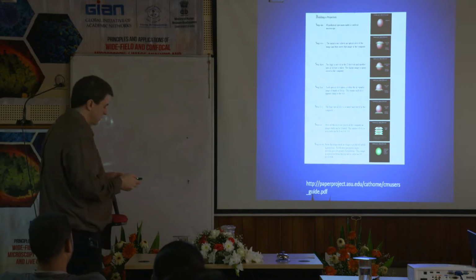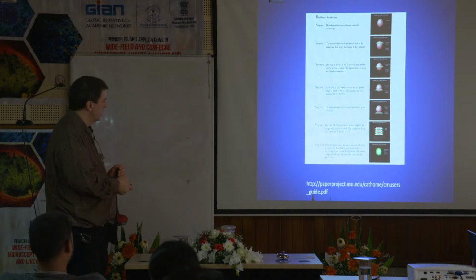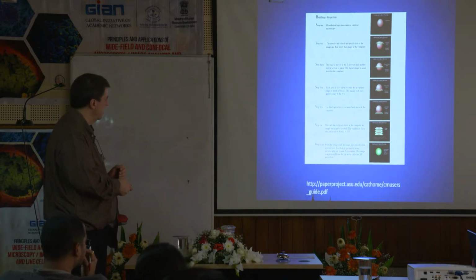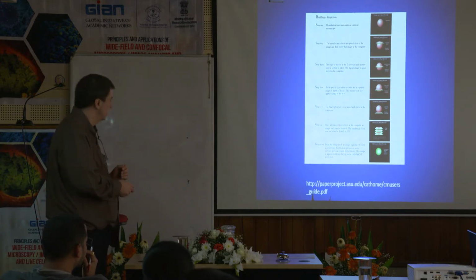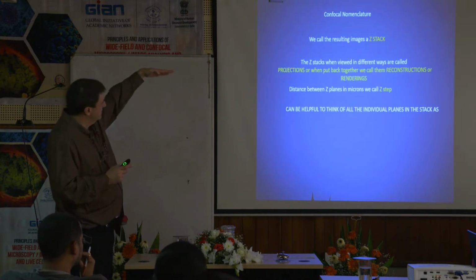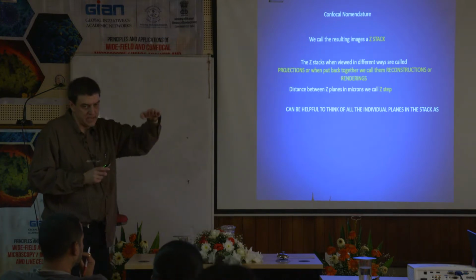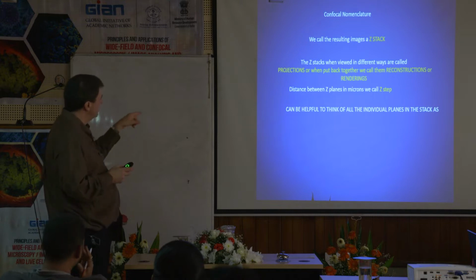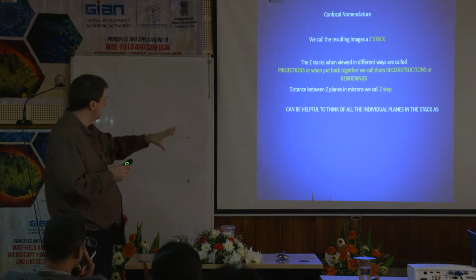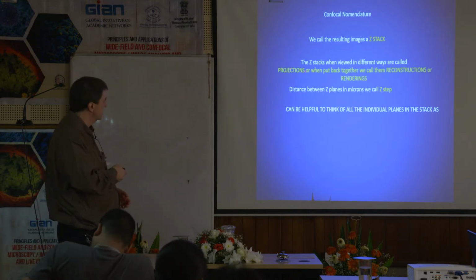As we can see though, we now have these numerous pictures of the ball, and by using software we can put these all back together and generate a picture of the ball. So we have optically cut the ball. What we call those is basically a Z-stack. Anytime you have a set like that, that's a Z-stack. When you take that Z-stack and put it on the computer and look at it, we call those projections.